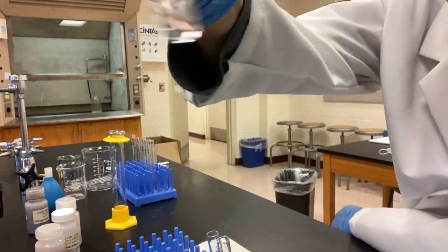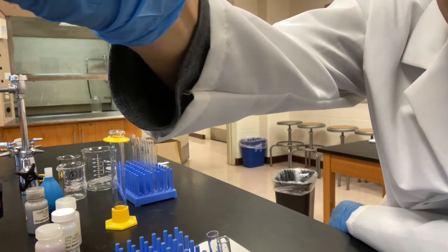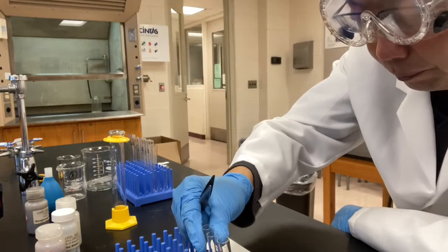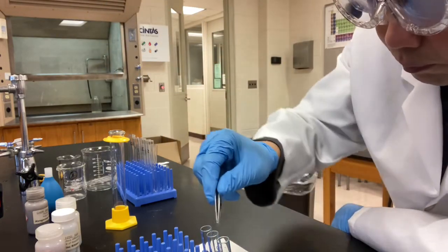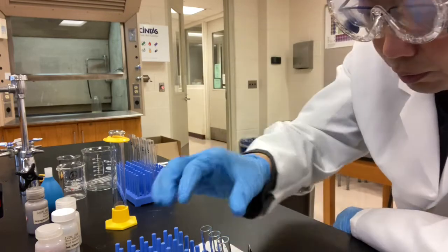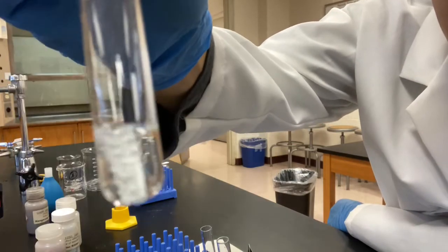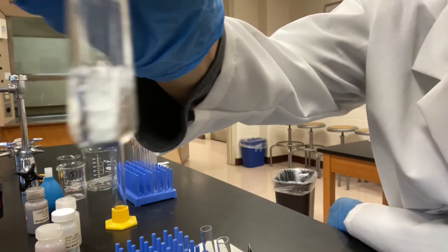Copper. There's no bubbles. There's no reaction at all. Zinc. Oh, we see bubbles. Okay, bubblings come out. I'm going to leave it here.